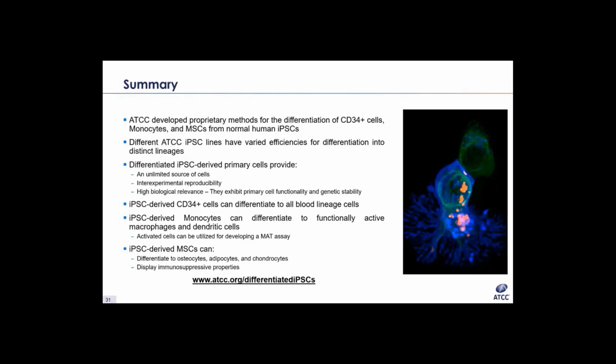So yeah, monocytes are typically in suspension, whereas macrophages like to attach to something when they differentiate. Some things that you can test for activation is to look for phagocytic activity, like I showed in the presentation.